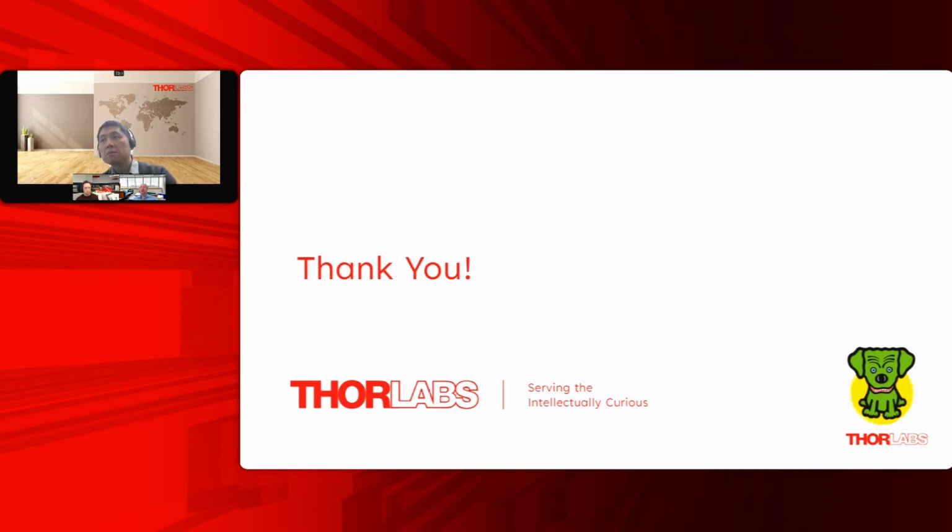In some scenarios, you may want to use fiber to guide the light to your sample. And coherent light or good beam quality can help you couple more light into the fiber. Then you have more light in the fiber and better signal to noise ratio, etc. Perfect. Thank you.